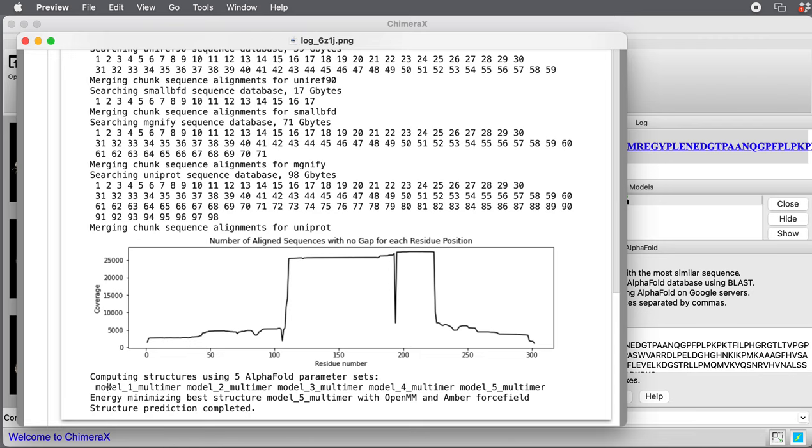Here at the bottom, once it's done all that, it's going to run five neural networks. These are the real heart of AlphaFold that will predict five structures. They were just five separately trained networks, and it will give a confidence score to each, and will energy minimize the one with the best confidence score. That will be loaded into Chimera X.